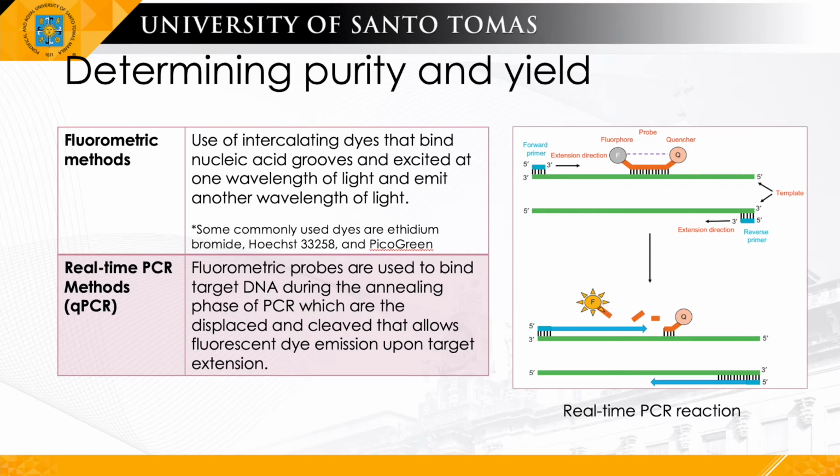The fluorometric method is another of those nucleic acid quantification techniques and is widely regarded as among the most sensitive methods available, because DNA is naturally colorless. The principle of these methods is that the dyes used can intercalate and bind nucleic acids, either non-specifically or selectively binding certain types of nucleic material.